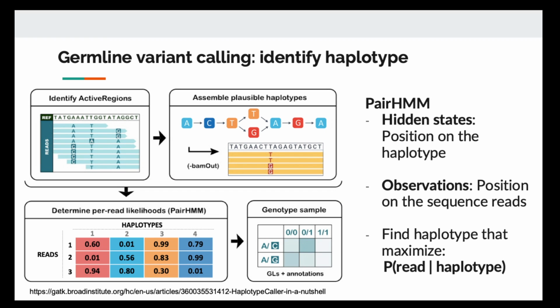So the way that we identify haplotype, which are mutations that are linked together, let's focus on short-read data because this is what we generally use for variant calling. With short-read data, the only way that we can identify mutations that are linked together is that they must occur on the same read, because otherwise we have no idea. The only way we can tell that this A, T, and G are linked is that we have to see reads with A, T, and G together on the same read. Otherwise we have no idea.